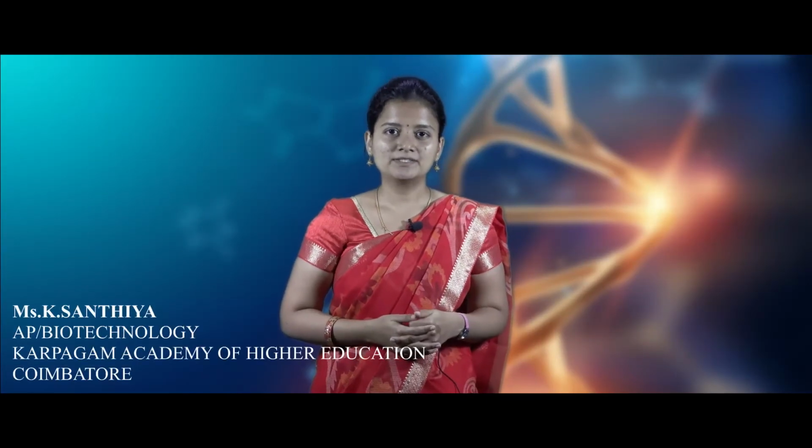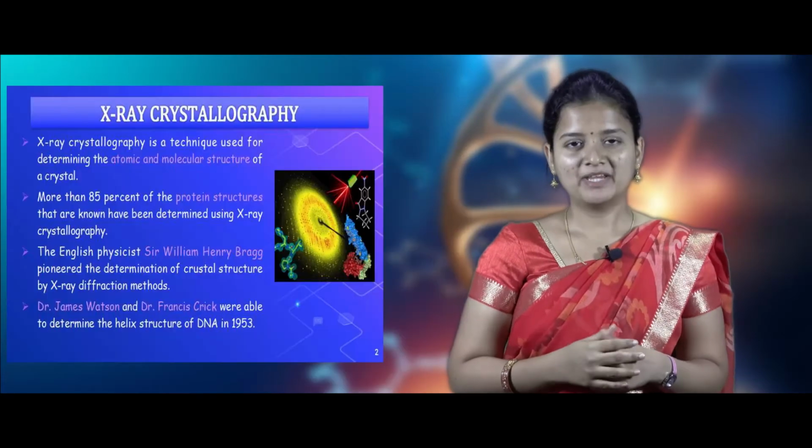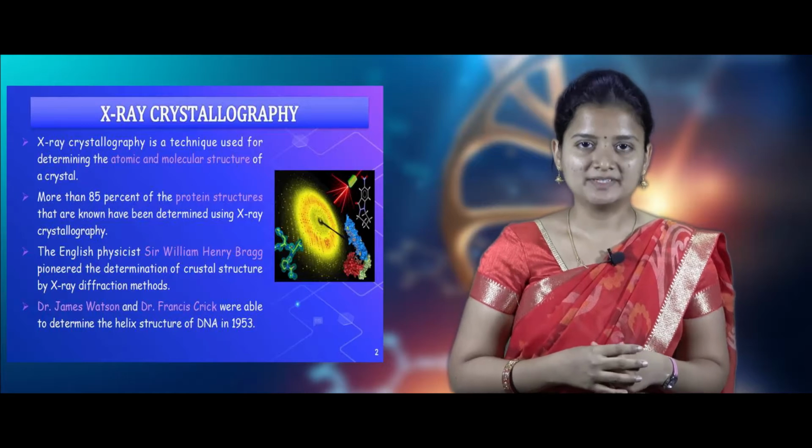Everyone. In the previous class, we discussed methods of protein structure prediction. In that, we saw different experimental methods and computational methods. Whereas in today's class, we will be discussing X-ray crystallography. This is one of the experimental methods. First of all, we have to know what X-ray crystallography is.